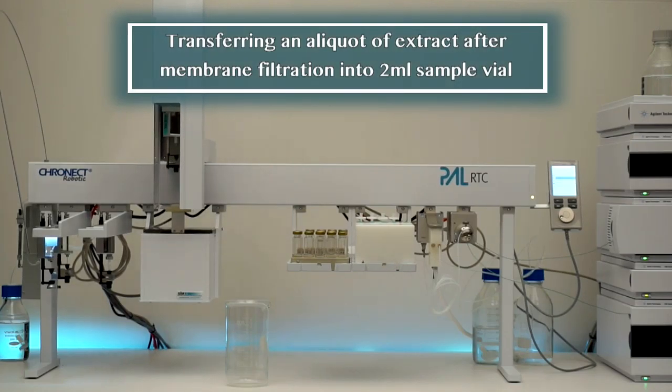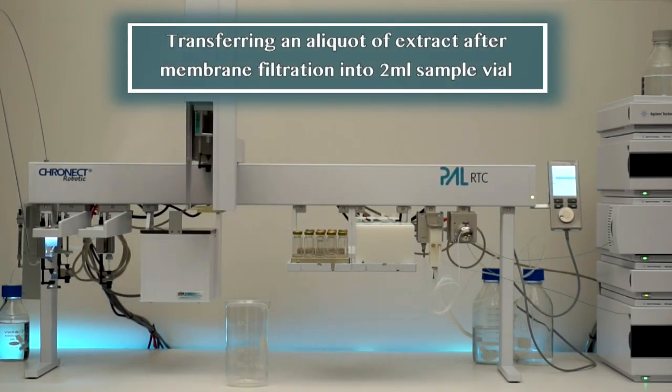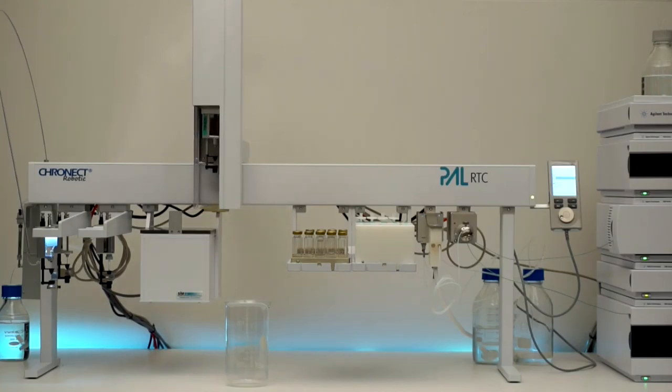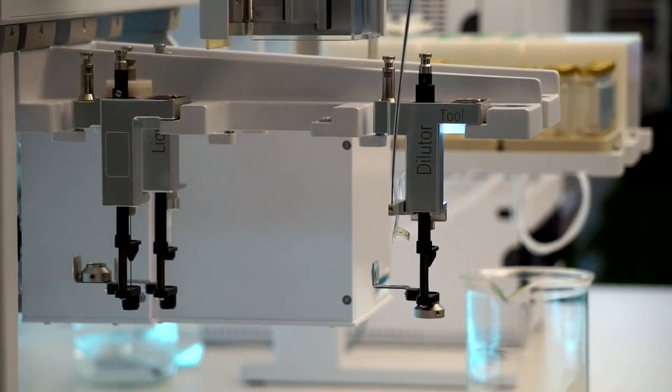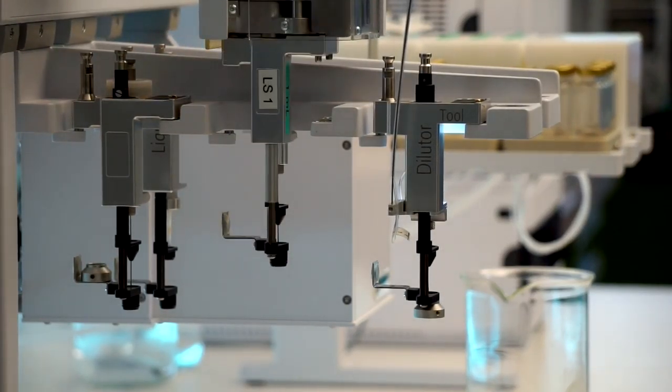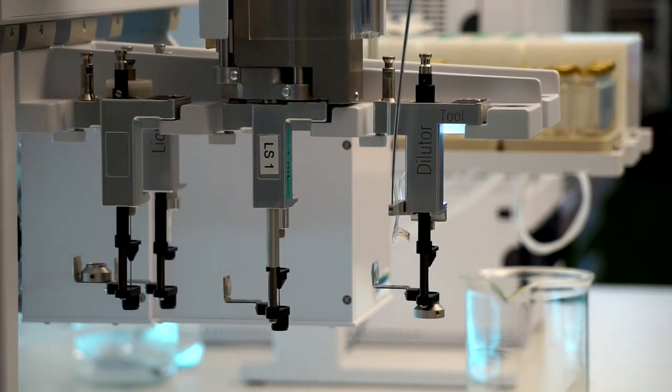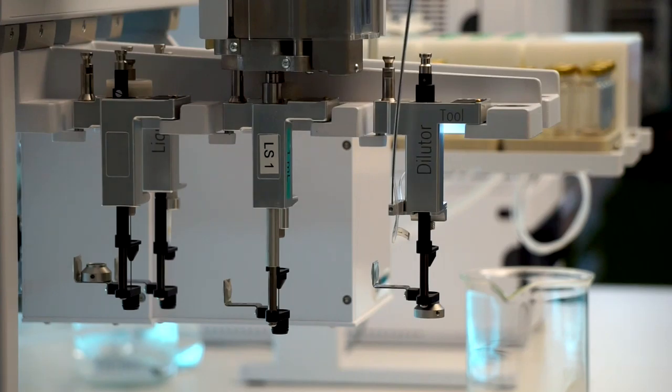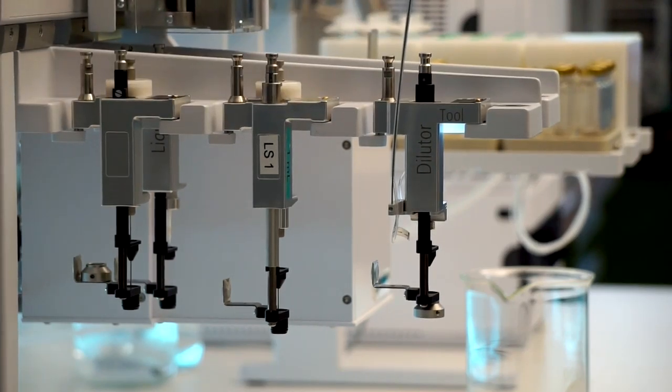Transferring an aliquot of extract after membrane filtration into 2 mL sample vial. The vial with the extracted sample is under pressure that must be removed before filtration. For this purpose, the robotic arm changes from the 1 mL syringe tool to the general syringe tool with Lure lock connection and takes out a syringe needle from the material tray.